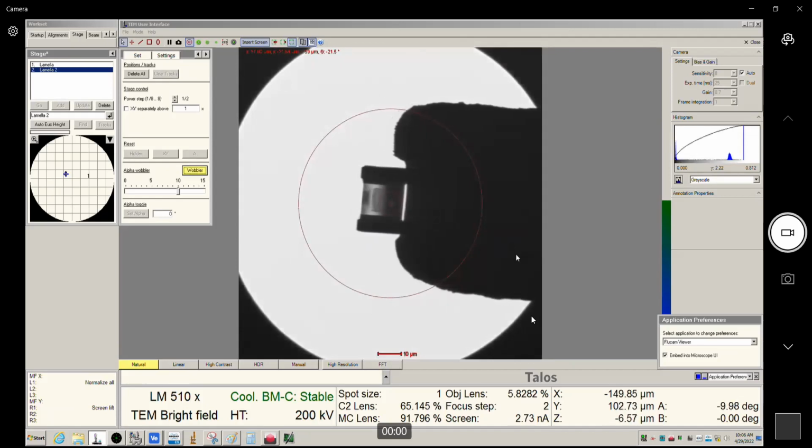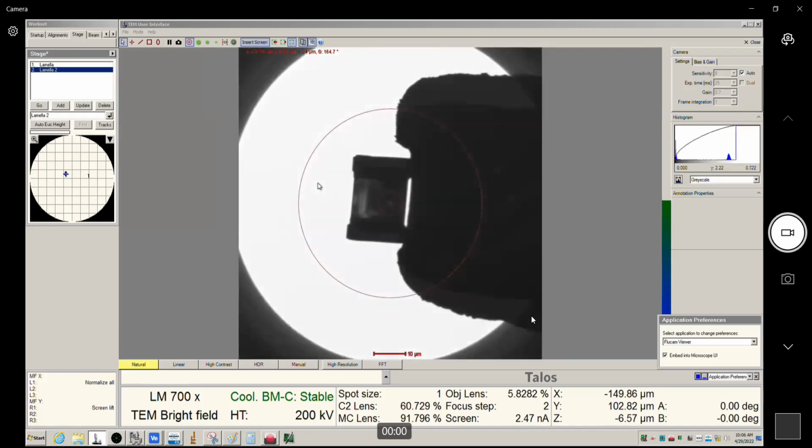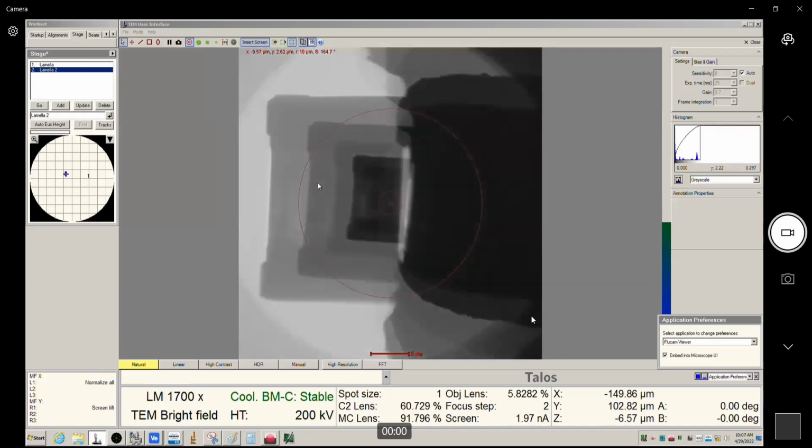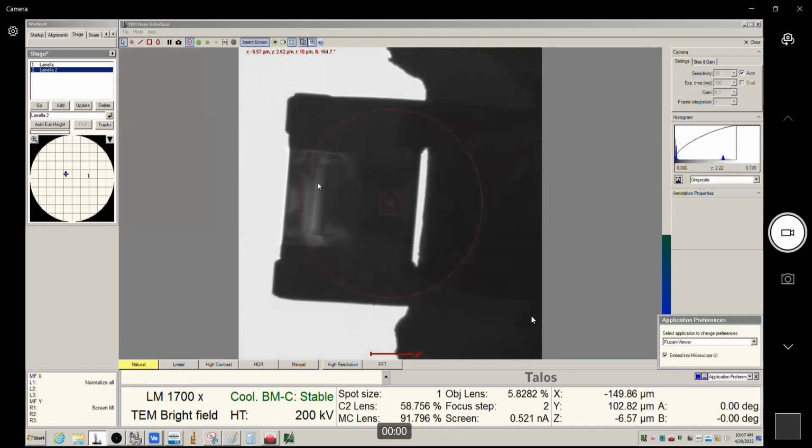The reason I bring this up is sometimes the focusing method, this isn't an SOP, obviously. And for full disclaimer, everything that we're covering today, feel free to try on your own. This is not something you need my permission to try. It's not damaging to the equipment, obviously, but something I wanted to just point out. But sometimes other people have an easier time doing the tilt method than the focus method.